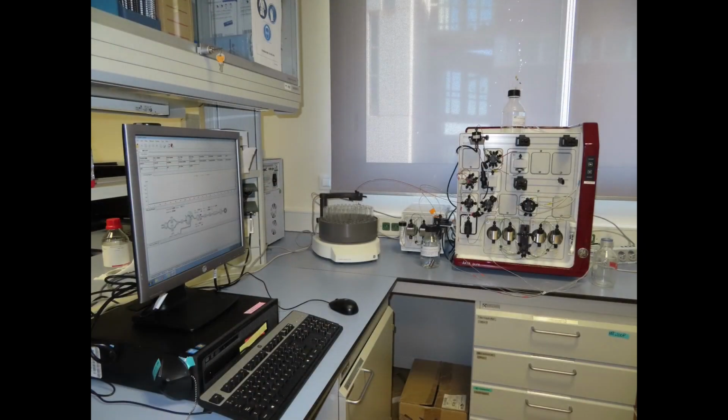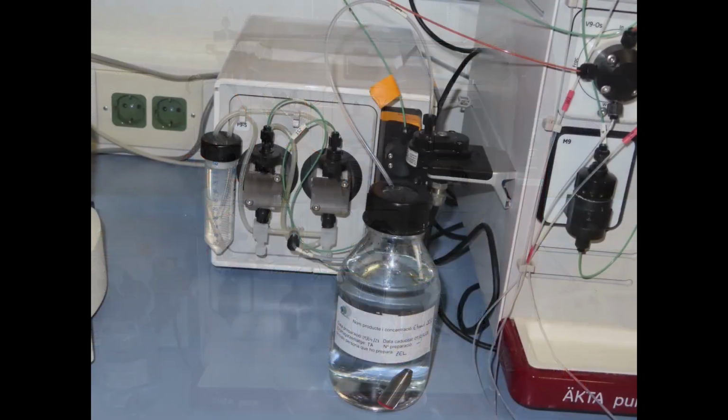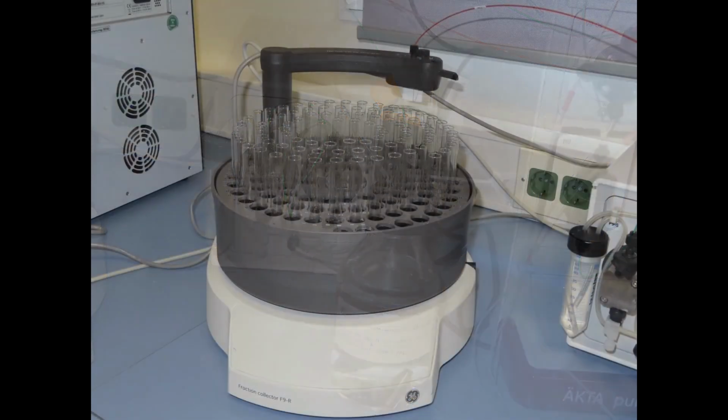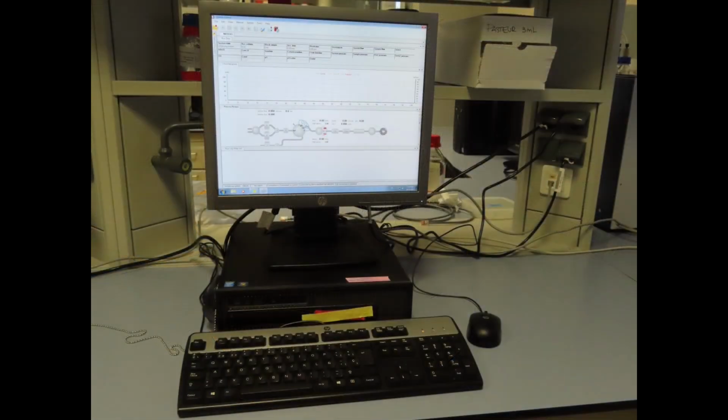For protein purifications, we use columns connected to a FPLC system, fast protein liquid chromatography. This equipment is composed of several parts: a main unit where the chosen column, the pumps, the ultraviolet, pH and conductivity detectors, the injection loop, valves, etc. are located. For large volume samples, there is an external pump to load the sample into the column. The fraction collector is a rotating rack that automatically collects fixed volume samples in separated containers. And finally, a computer with specific software to record all data and to control manually and automatically the FPLC operation.